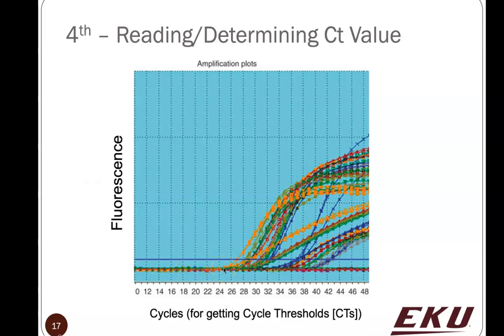And eventually, if there was a whole lot of actual starting RNA and then a whole lot of that complementary DNA produced from that, when it starts to get amplified in an exponential fashion, we will then get a fluorescence signal, because of the kit that is used, that the machine will recognize.